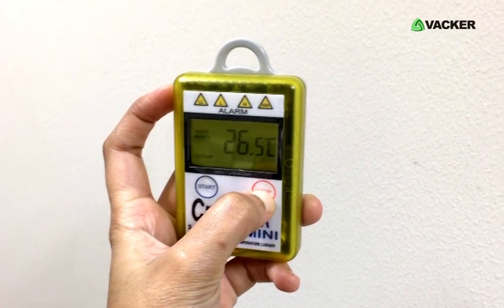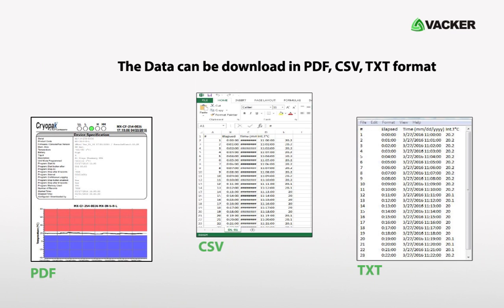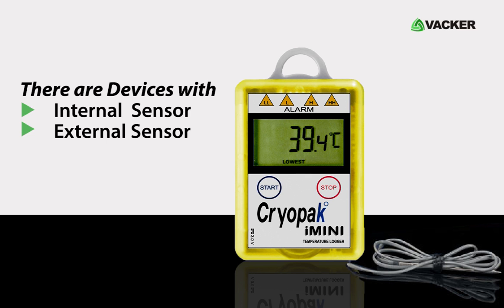To stop the logger, press the stop button on the right and you can see the word 'stop' on the screen. The data can be downloaded in PDF, CSV, and TXT format. There are devices with both internal and external sensors available.